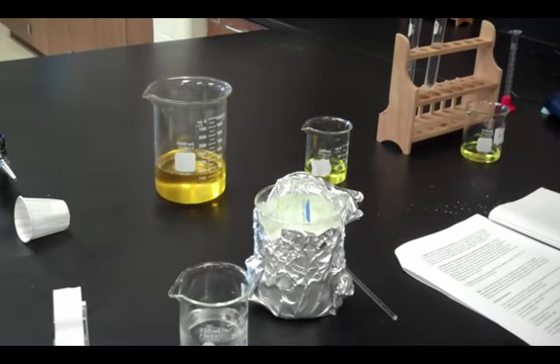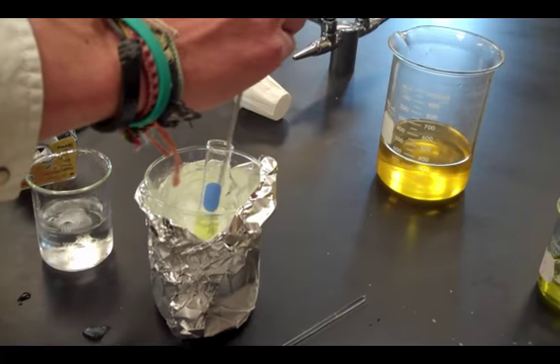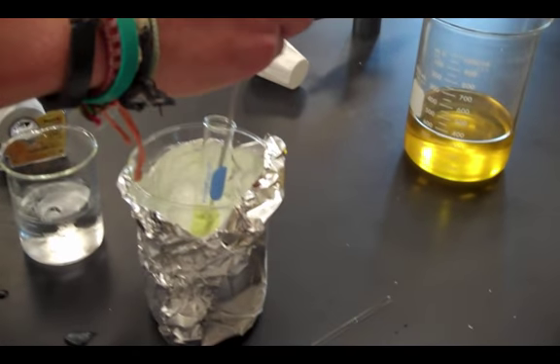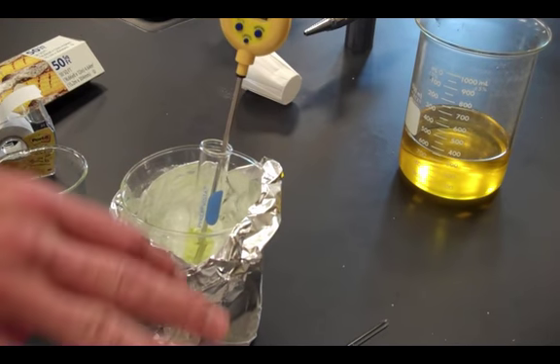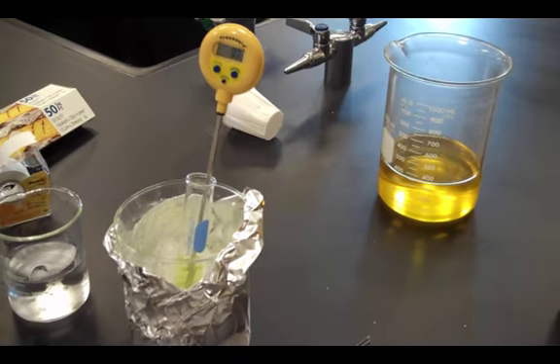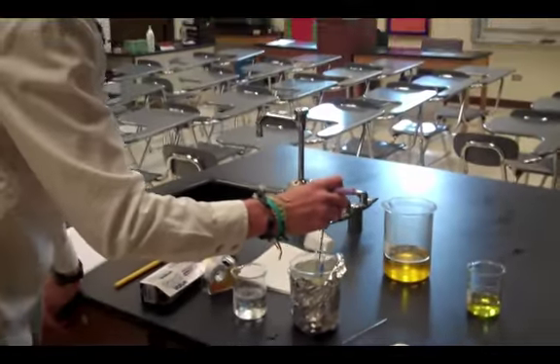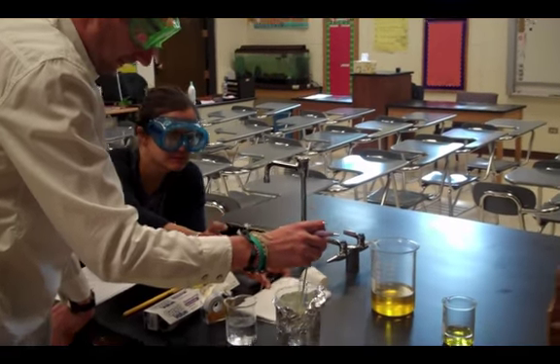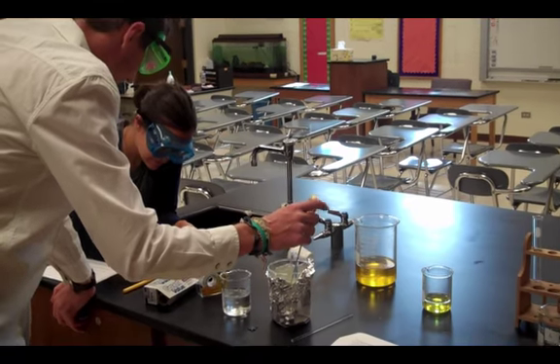I'm going to take my thermometer, rinse that off real quick. And I'm going to stir my solution A. While I'm stirring it, I'm also going to record the temperature every 30 seconds in my notebook. So 9.7.